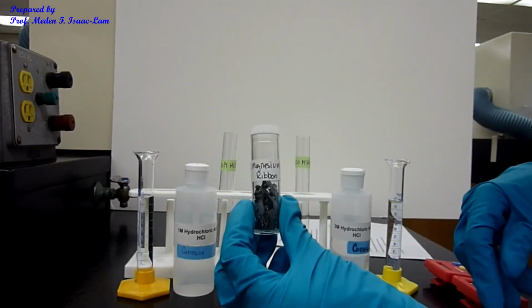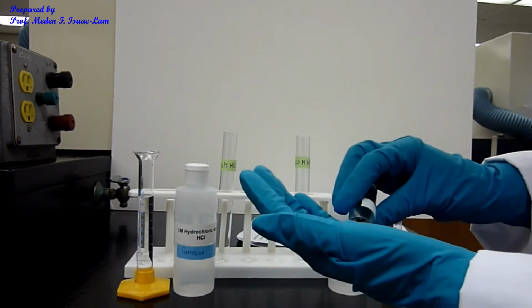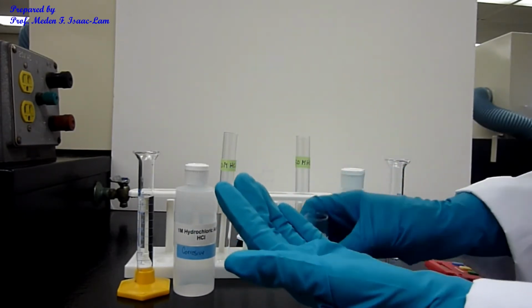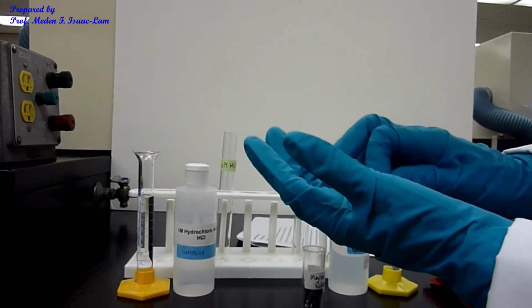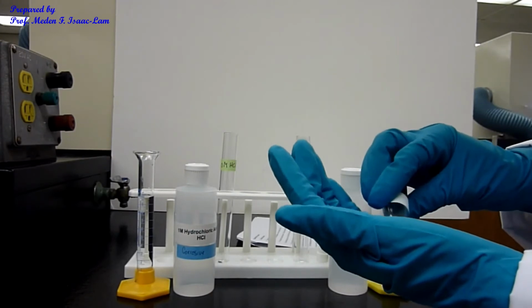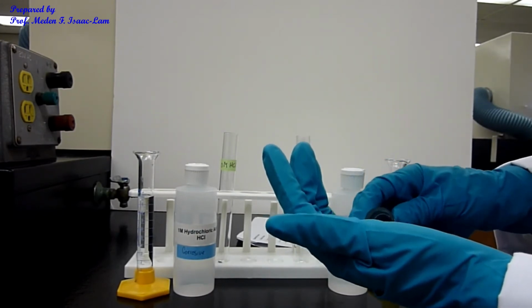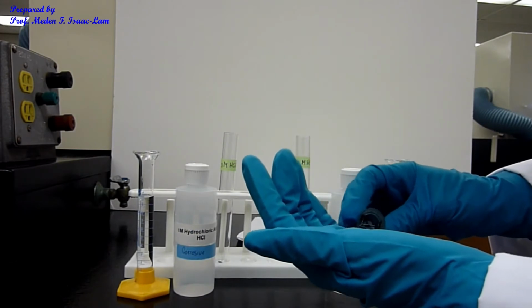So this is the magnesium, and I'm going to take one strip. Then put it in one tube, and then almost equal in size, another strip.